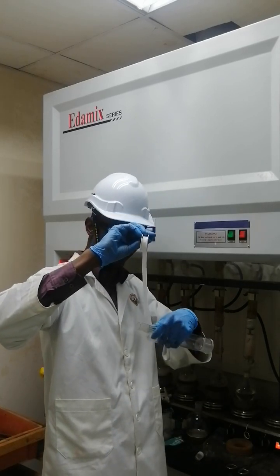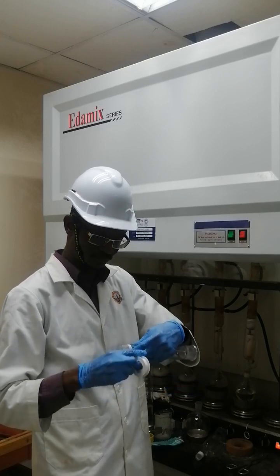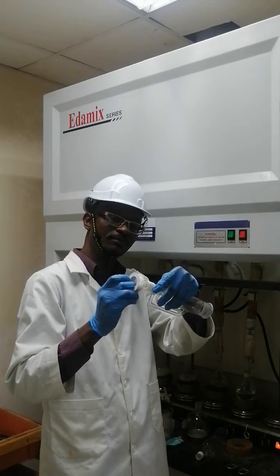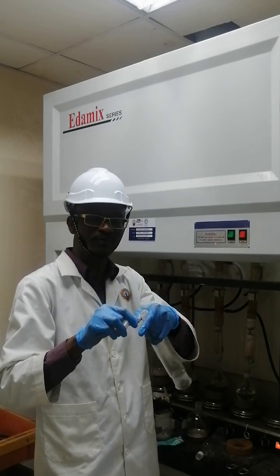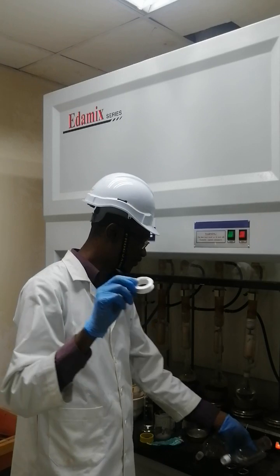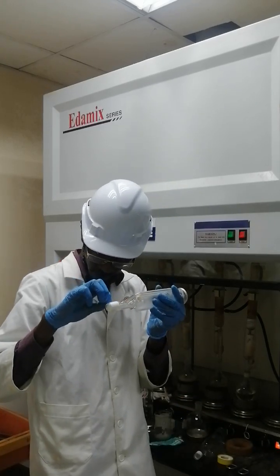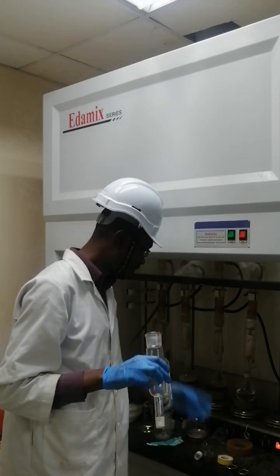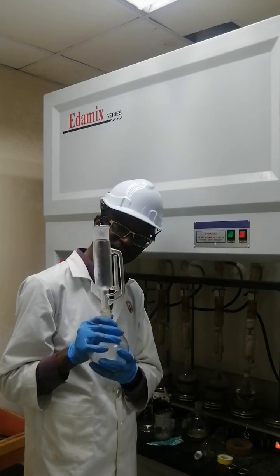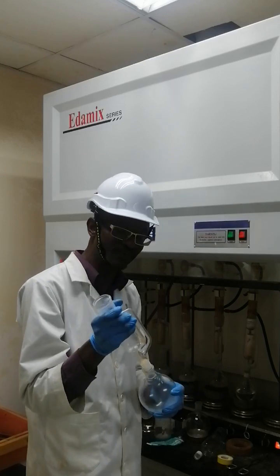All you need to do is to weave it around, like this. Weave it around, a thin film of PTFE. PTFE, by the way, is polytetrafluoroethylene. Once you do that, you can slot it in. So once you finish your extraction, it will be very easy to remove, and you take your data and carry out your solvent recovery.